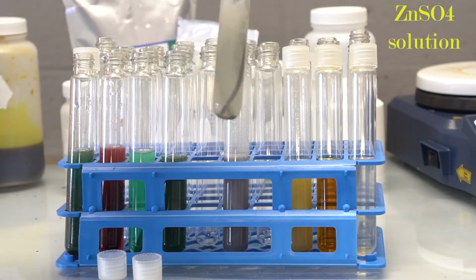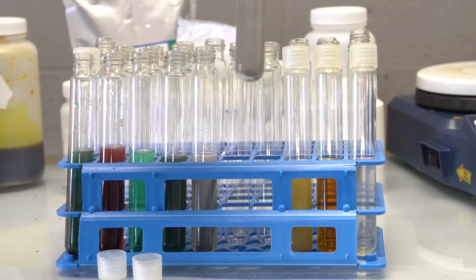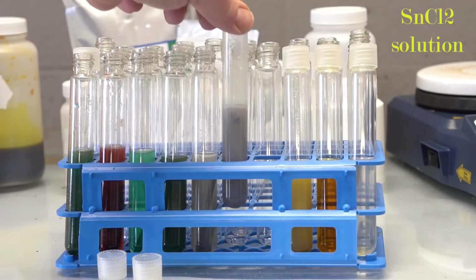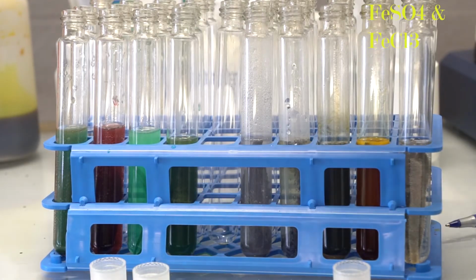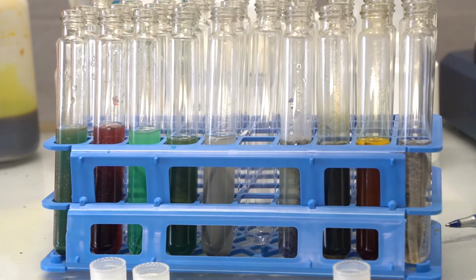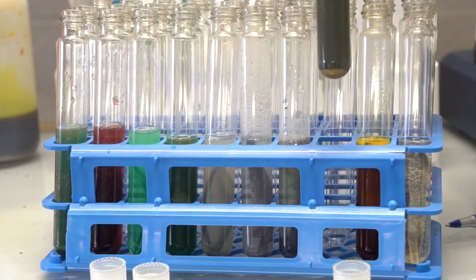First, we lined up a gauntlet of 11 metal compounds in solution: copper(II) sulfate, cobalt(II) sulfate, nickel sulfate, vanadium(V) sulfate. We made the vanadium(V) sulfate on the spot from vanadium pentoxide, sodium carbonate, and sulfuric acid. Most procedures use a very lengthy process to synthesize ammonium metavanadate, but our shortcut methods seem to work just fine. We also had zinc sulfate, tin(II) chloride, lead(II) nitrate, ferrous sulfate, ferric chloride, sodium tungstate, and sodium molybdate.